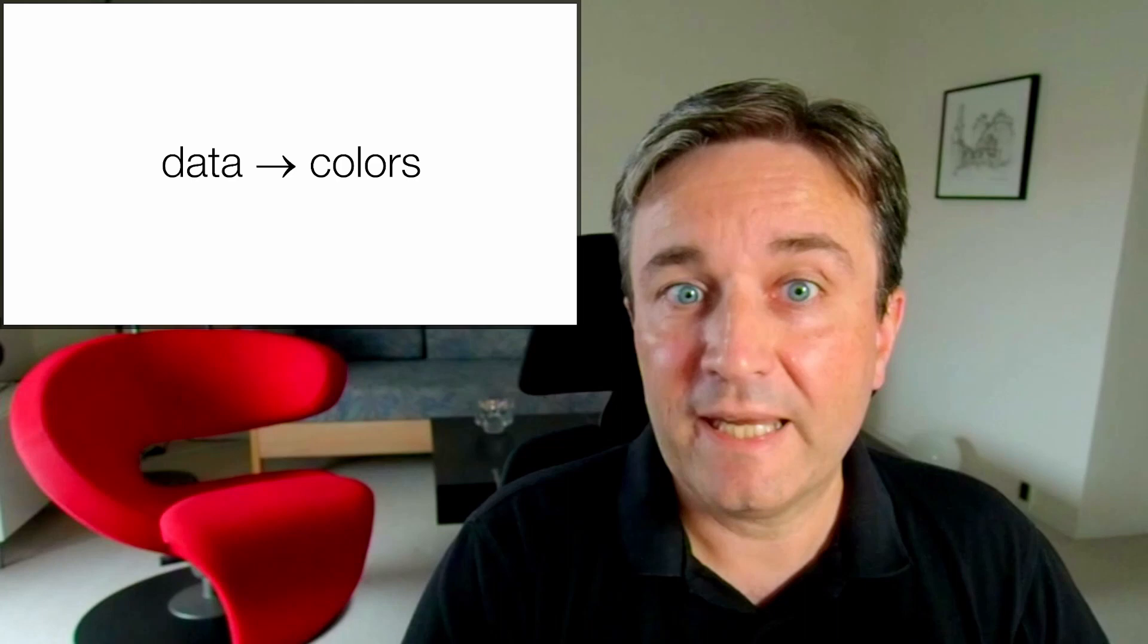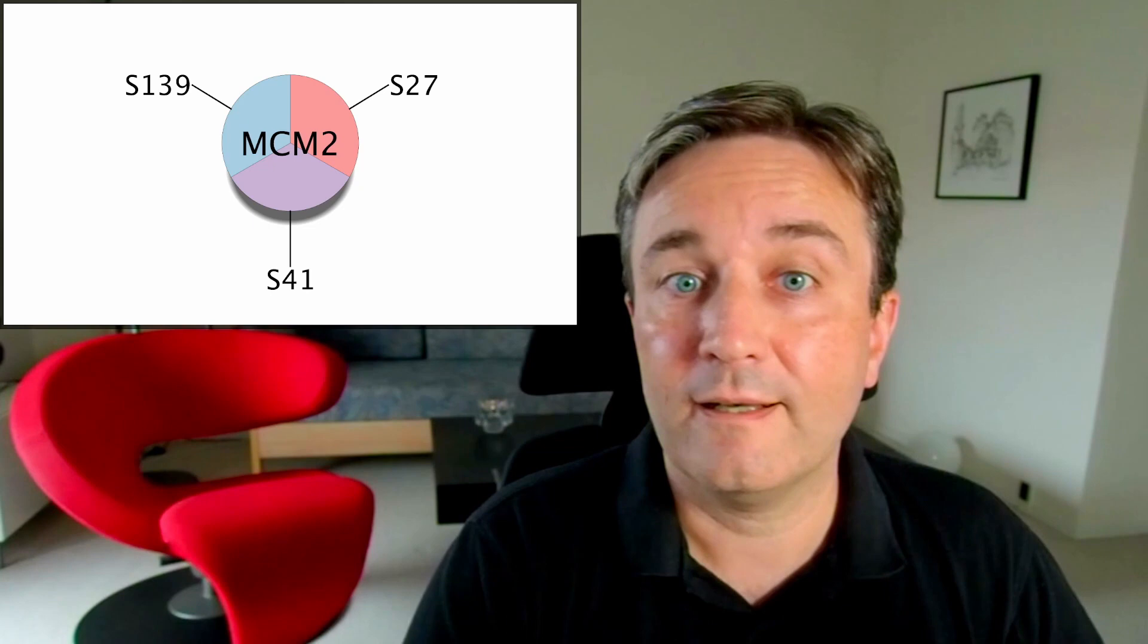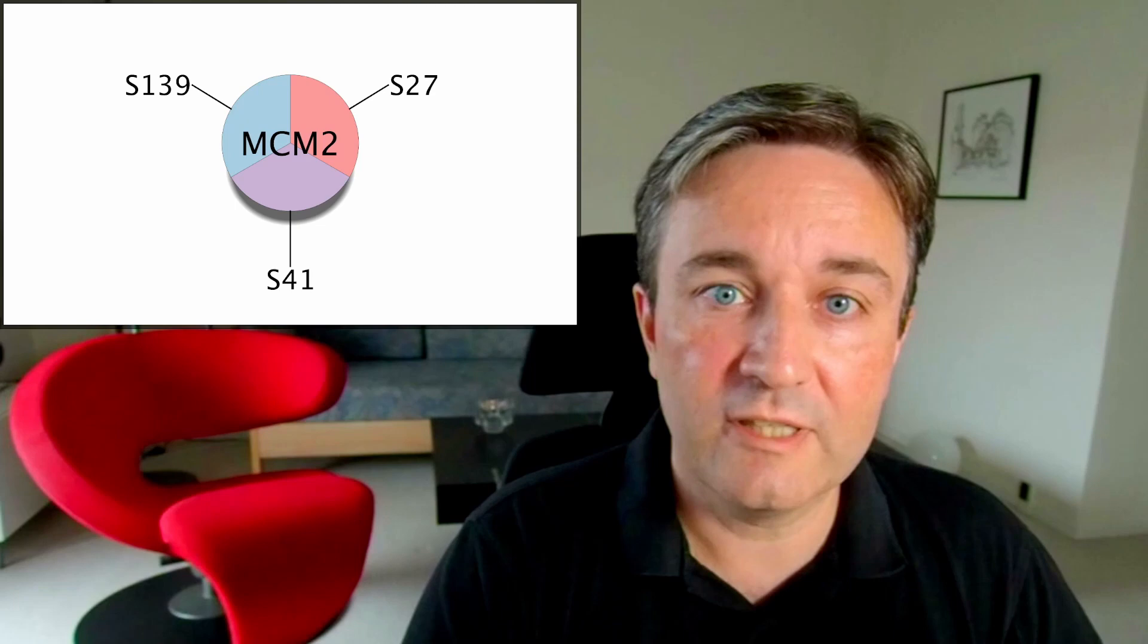You can use a pie visualization to show either discrete mappings of categorical data, like this, where you have three parts representing different phosphorylation sites, with different colors representing different categories.